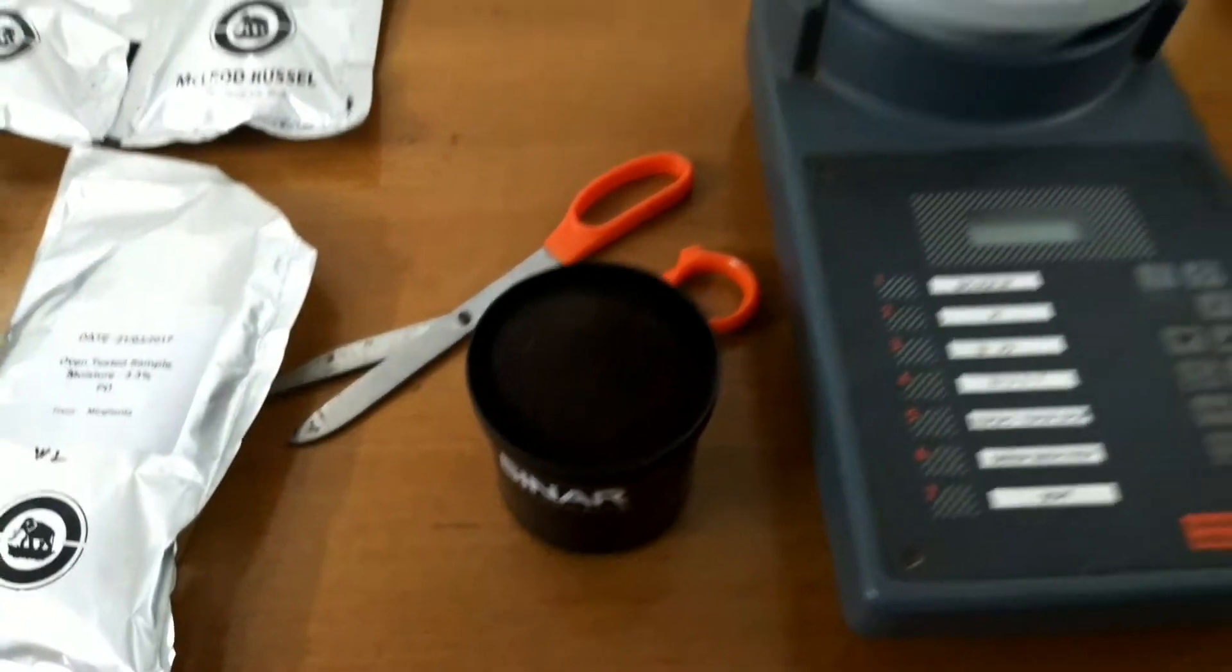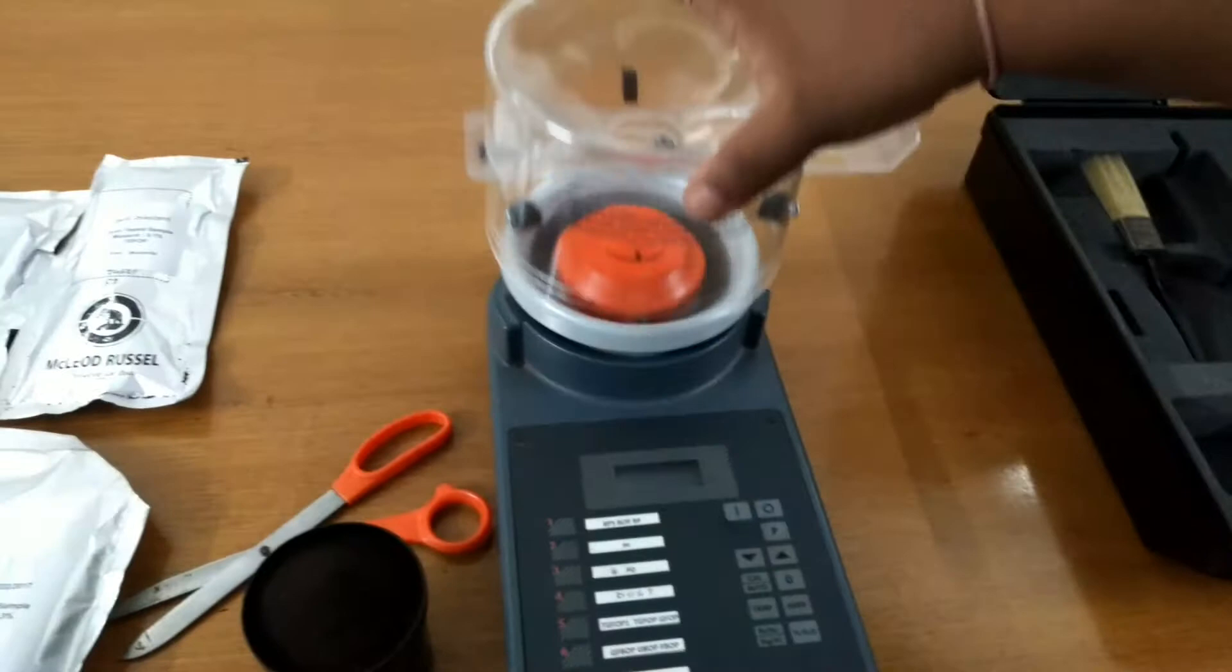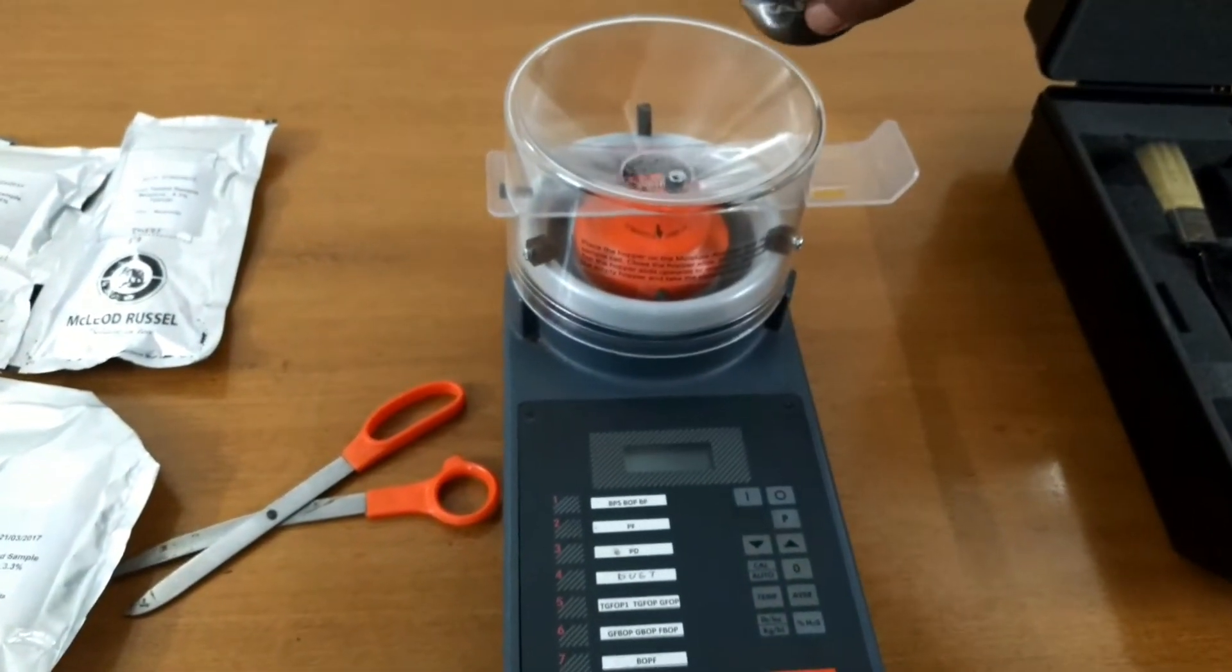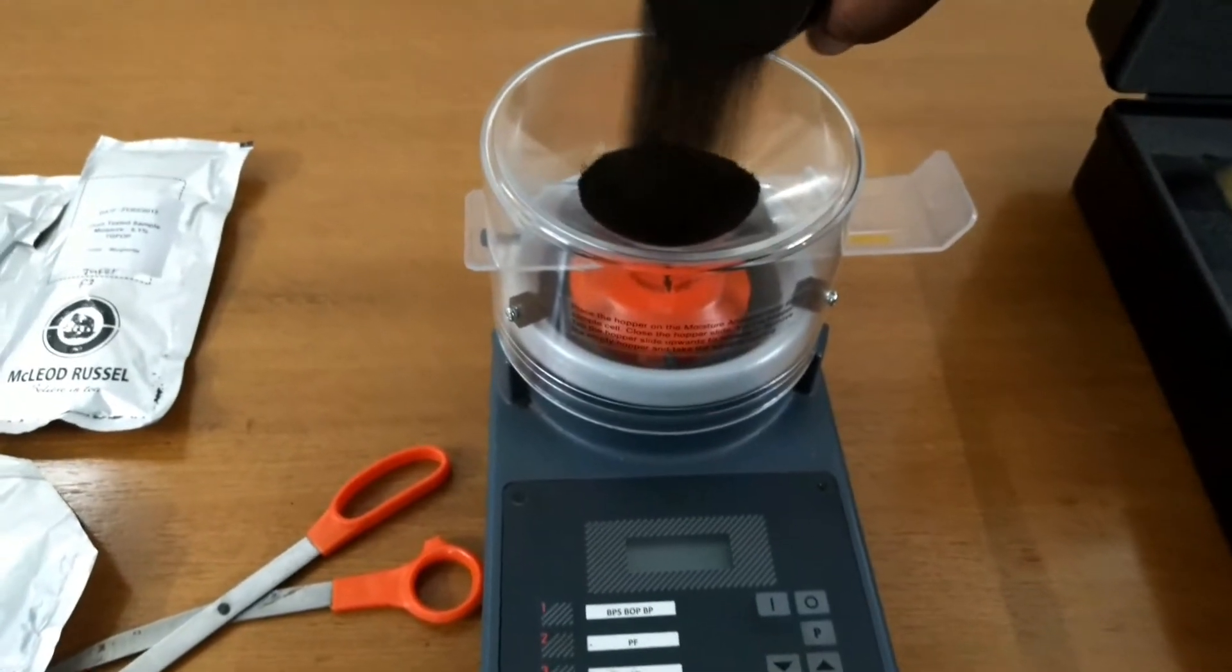After this, put the loading hopper to the machine, take the T samples, and fold it slowly into the hopper.